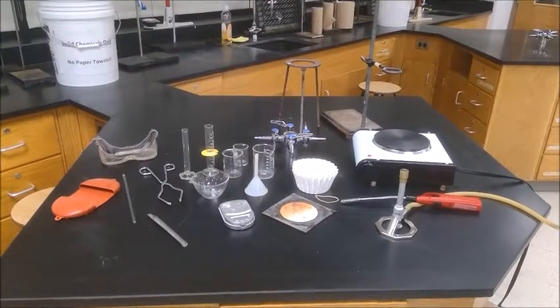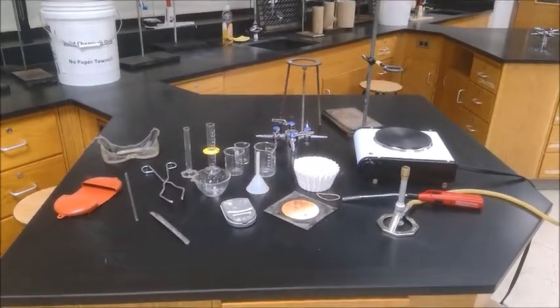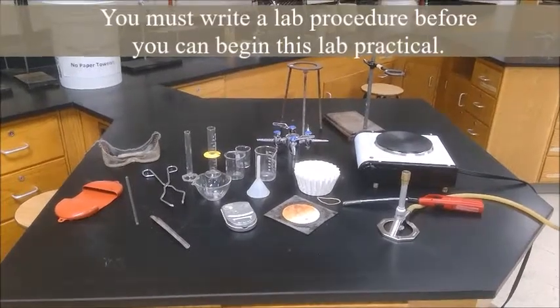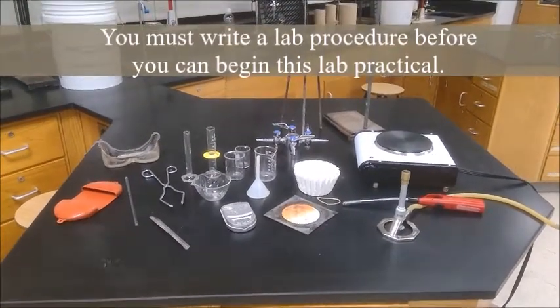Before you can begin this lab practical, in addition to completing the pre-lab assignment and reading over the SDS, you're going to have to write out your own procedure that your instructor will check off before you begin the process.